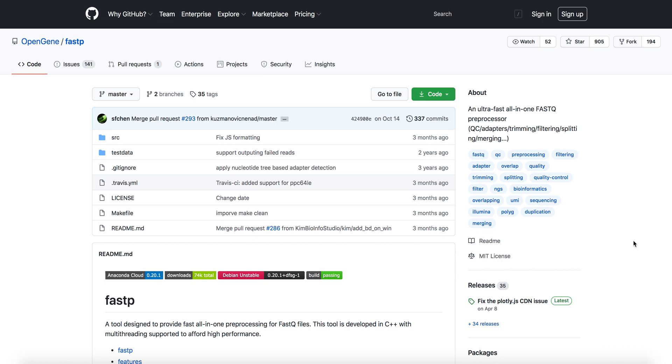Welcome back. Today we're going to talk about FASTP, an ultra-fast all-in-one FASTQ preprocessor. You can use this for RNA-seq experiments, DNA-seq, or anything else that involves a FASTQ file.